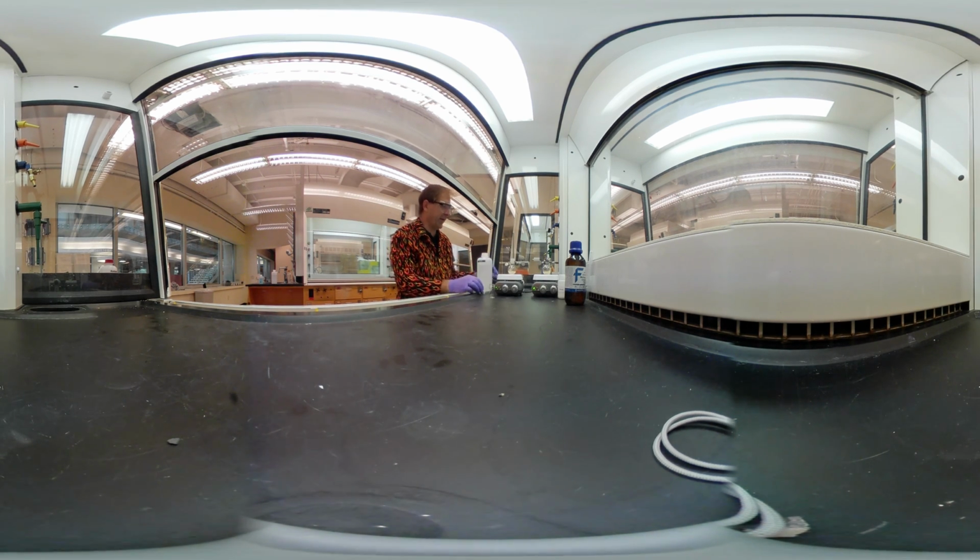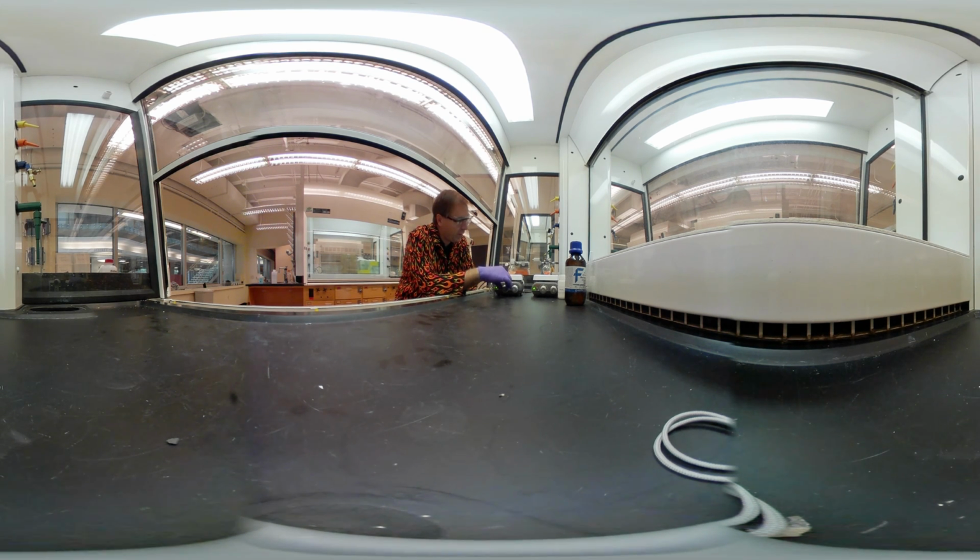You'll notice that we get a color change. Okay, that's evidence of our oxidation reaction that's happening. So this will go more and more bright red. So it's not stirring quite as well. Let's get that going. We've got a nice red color forming there. That's good. We want the red color. So we're going to let this stir now for 20 minutes, and then we're going to isolate that compound. So I'll see you in 20 minutes.